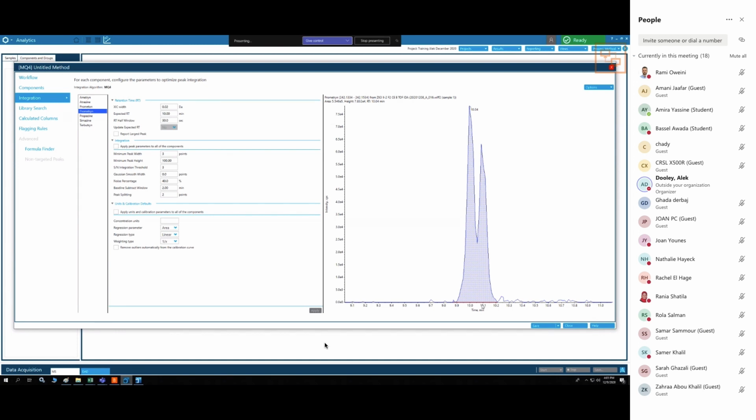So let's set up the peak splitting and so on, and we'll just guess. We'll say second, and then I'll show you how to check that when we get to the data. All right, so I'm going to adjust the peak splitting window, and I'm going to put 0.1. And then the peak splitting, I'll say 1 here, apply. Right, so now you see I'm able to split them.